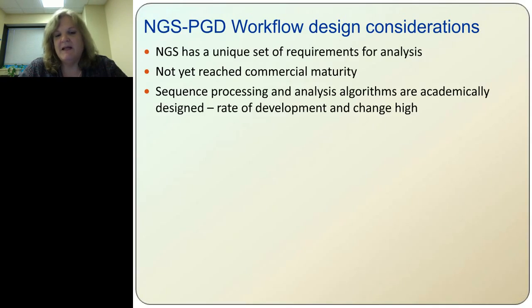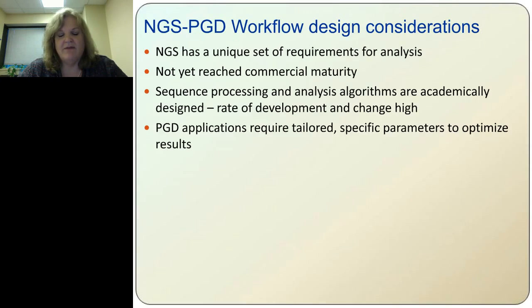It's because they're academically designed, so the rate of development and change in the software is pretty high. Some of it's pretty established, but there's always room for improvement, and it's still a developing method. So especially as the data density gets bigger and bigger, there's going to be more and more software that comes out to manage the data. So that's a design consideration in whatever platform you use to do NGS sequencing.